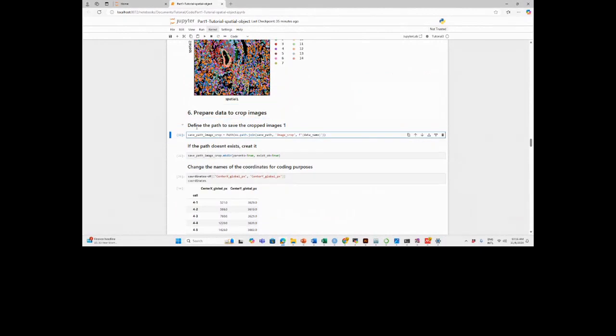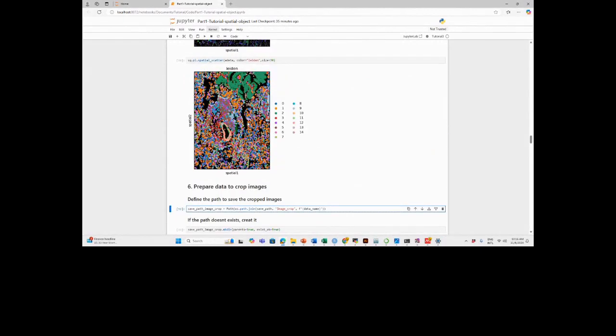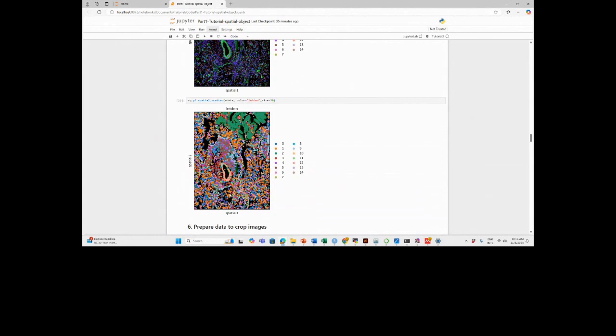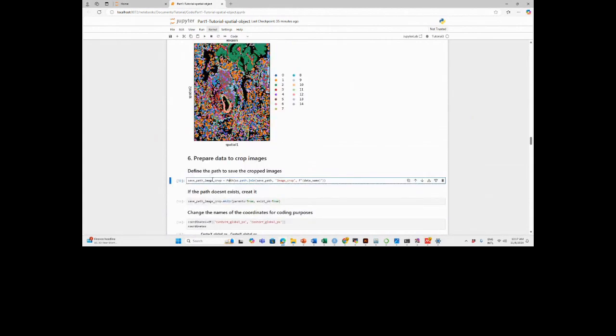So what we showed before is the complete image, right? The overlapping transcription data. Yes. Now, for each cell, we're going to get one morphological image. For that, we're going to approximate. It's an approximation. Okay. Yes.